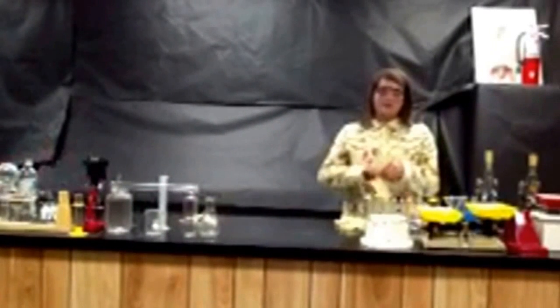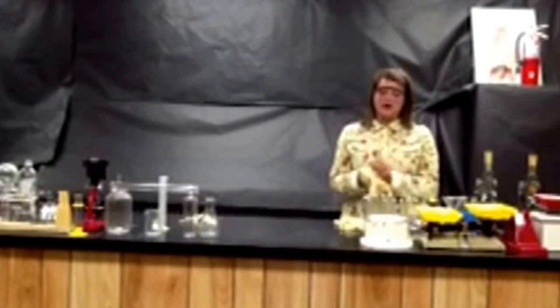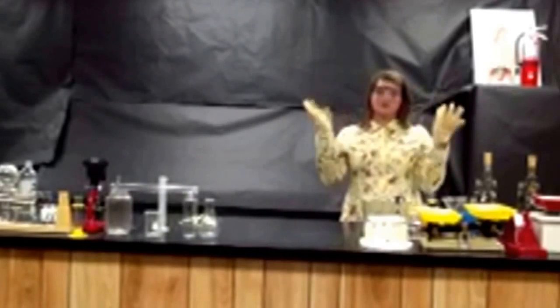We have to wear gloves in the lab to protect our hands. They keep our hands from being exposed to chemicals and other hazardous materials. These are what real safety gloves look like.